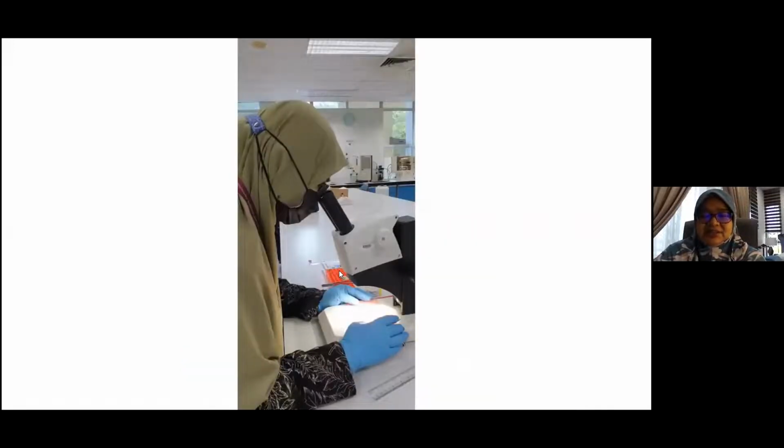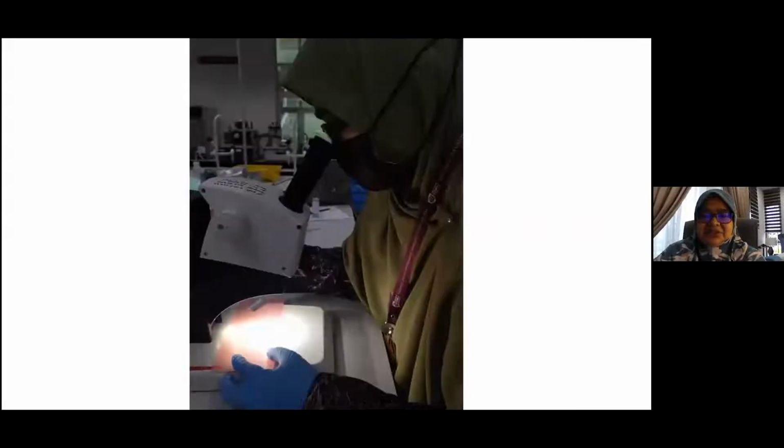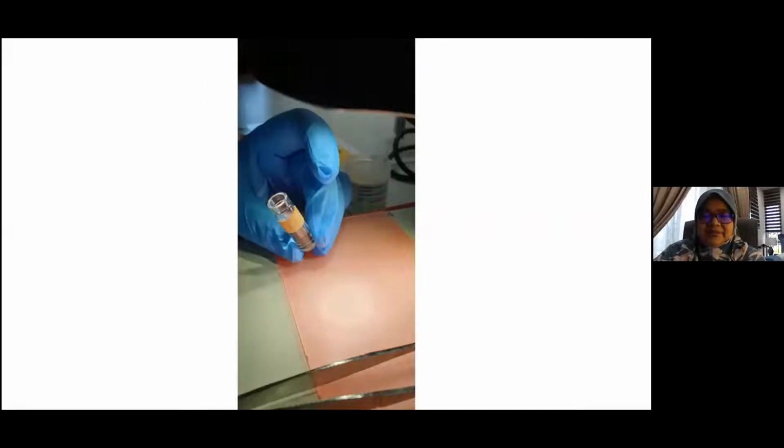Because it's a very tiny tissue, I need to look under the microscope for that, and so I make the appropriate sections.